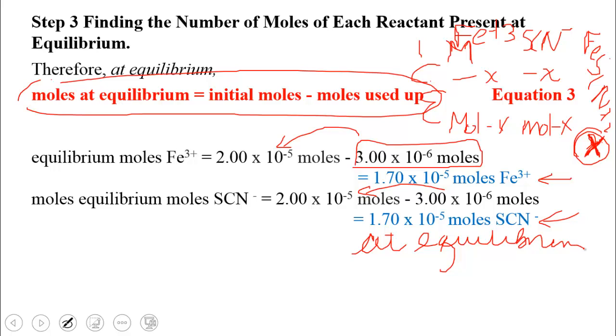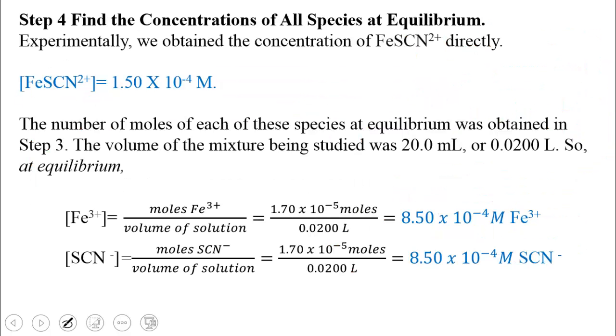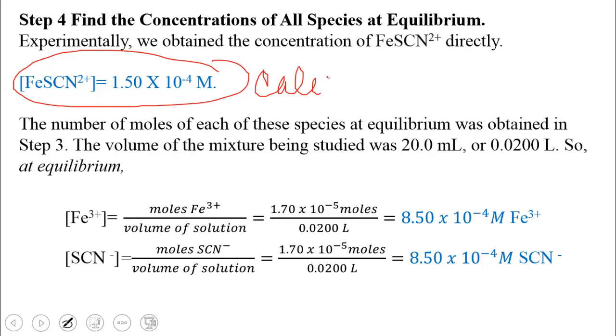Okay, and again, I have defined my equation, and I just need to show one of the examples. Now, what I can do then is, we found the concentration of the complex directly. This was from the calibration curve.